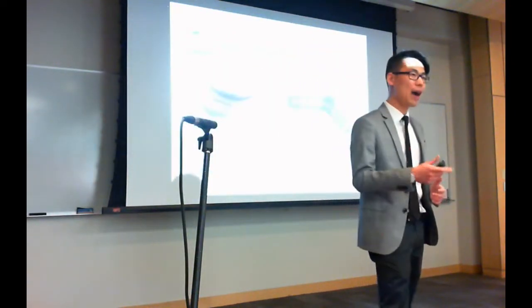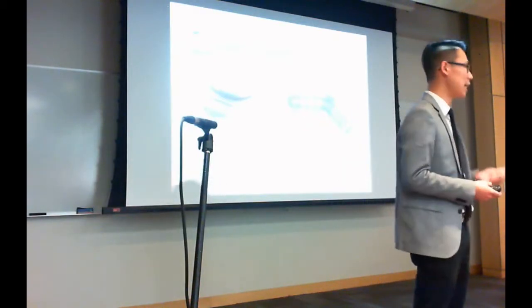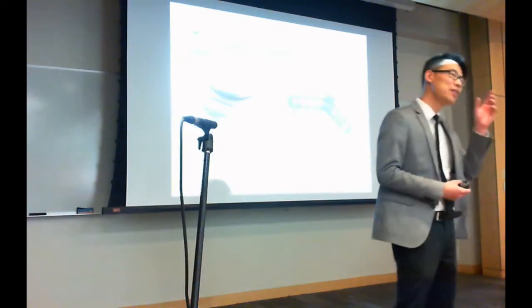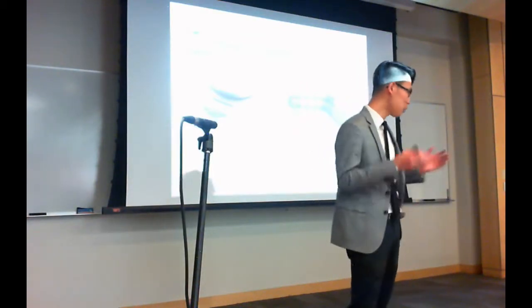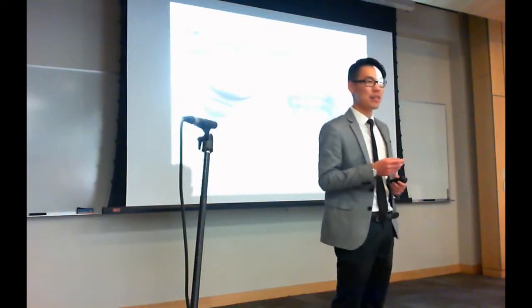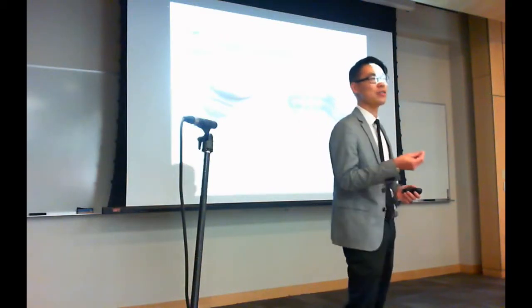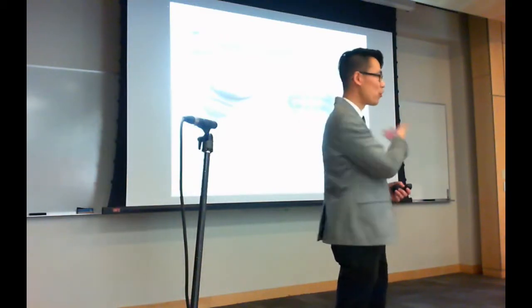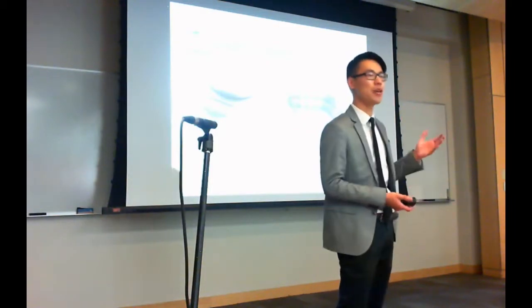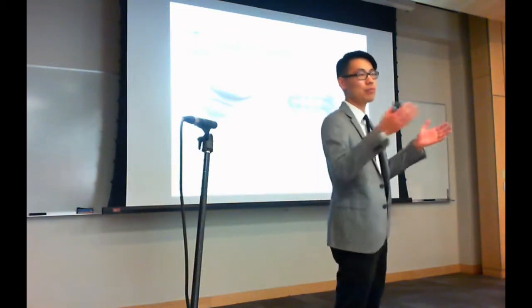So how do we start looking at these molecules around us? One of the techniques that we've bought into is mass spectrometry. Why mass spectrometry for this particular application? One reason is it's high throughput. We can look at tens of thousands of molecules in a typical experiment over a span of several minutes to an hour, in contrast to other techniques where we're talking about a couple compounds over a couple hours.